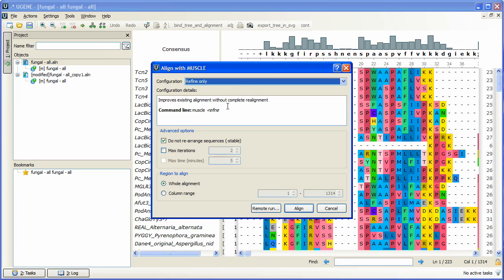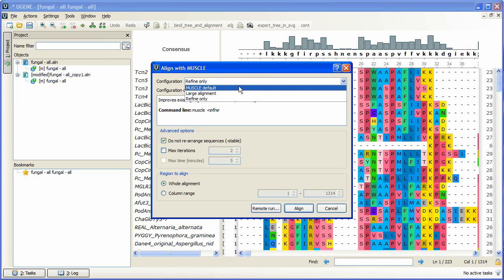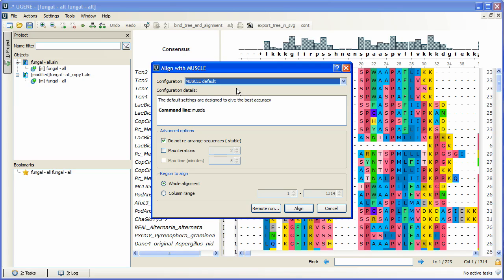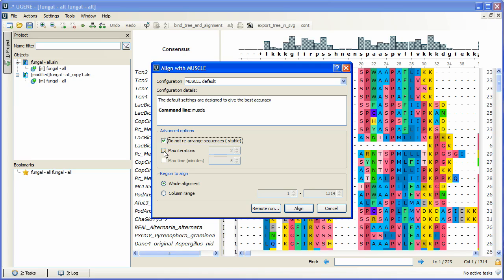We choose the default settings to make the best alignment with Muscle. Further, we can trigger the sequence rearrangement checkbox if we want Muscle to rearrange sequences. Also, we can specify the maximum algorithm iterations number and specify the region to align. We will align the whole alignment. Click Align.